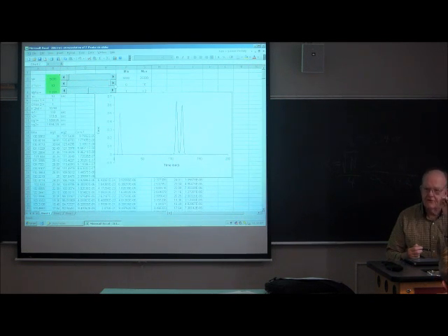The problem with this initial separation is that there's too little retention to start with. And if there's too little retention, you really need a huge increase in plate count, or you need a relatively larger increase in selectivity to do the job. But adjusting N and adjusting alpha is a lot harder in general than adjusting retention. In gas chromatography, if you ever want to get more retention, all you have to do is lower the column temperature. That's it.